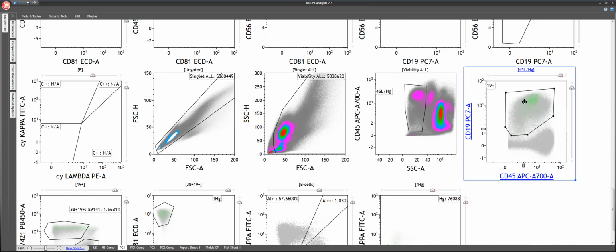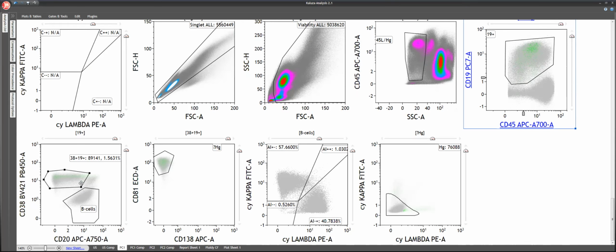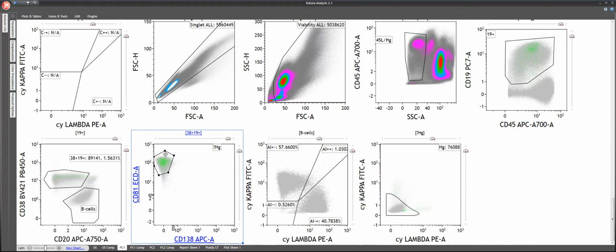you see there are some plasma cells there, and then we identify hematogones by using CD20 negative and CD38 positive cells, because hematogones show variable CD20 and a moderate level of CD38. So these are the cells, and these are mature B cells. So we have mature B cells, we have hematogones here, and because we can still have some plasma cells here, we use CD138 and CD81. So the cells which are CD138 negative and CD81 bright positive are basically hematogones, and these are B cells.